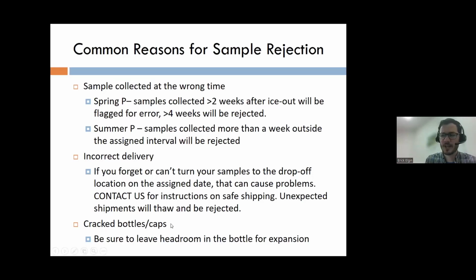And of course, another way is that we reject samples if they're cracked. So make sure to pour out a little bit of that water so that when you freeze it, when the water expands, it doesn't crack the bottle.